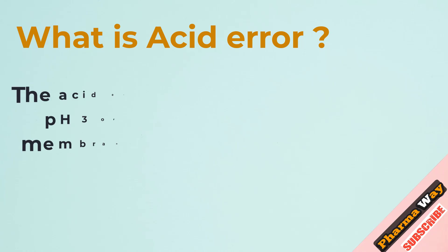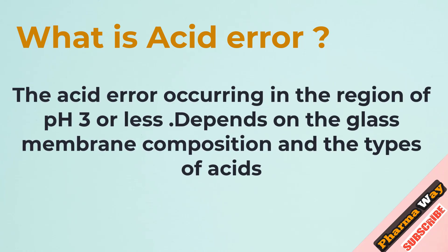What is acid error? The acid error occurs in the region of pH 3 or less, and depends on the glass membrane composition and the types of acids.